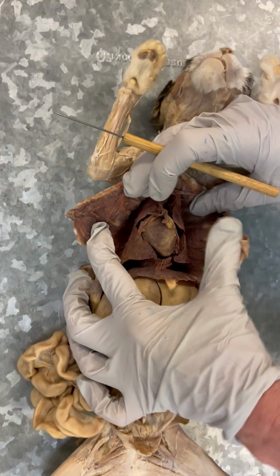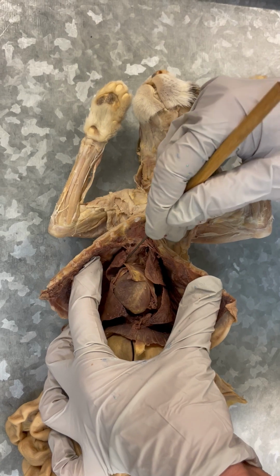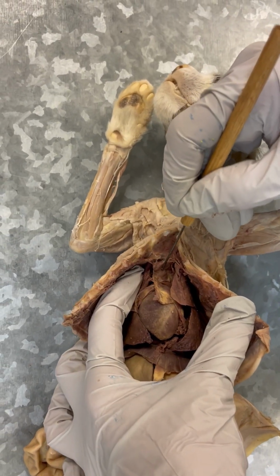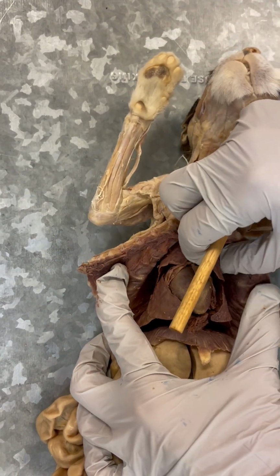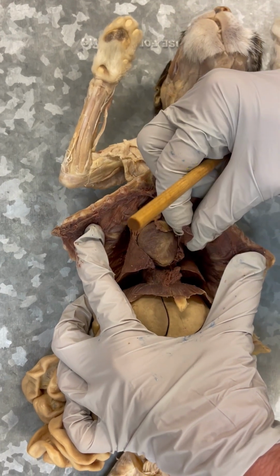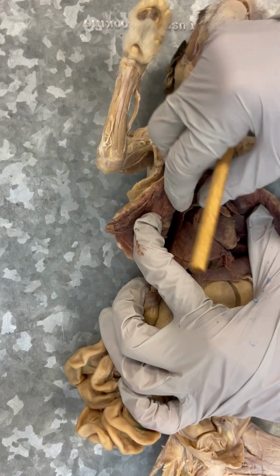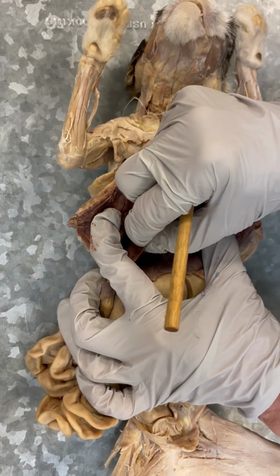Coming over here, we will see, and this is not a very nice looking version, but this is the thymus up here. And we have 3 lobes of the lungs. So this is the left anterior, left medial, left posterior. This is the right anterior, right medial, right posterior.